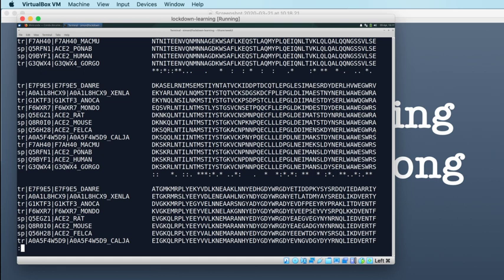So I know it's taken the best part of 20 minutes to get back to the point that we left it yesterday, but I think, one thing, repetition is always quite useful, but also we have corrected a mistake that we made, and I will point out, and I know this is a point that maybe I'll belabor as we proceed, that we discovered that mistake, and it was a mistake.